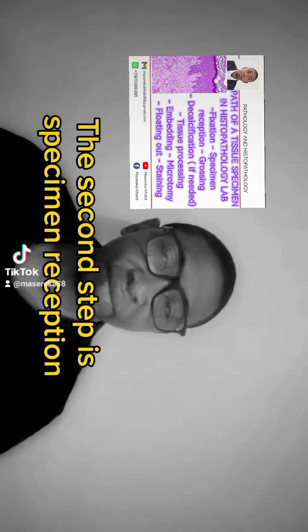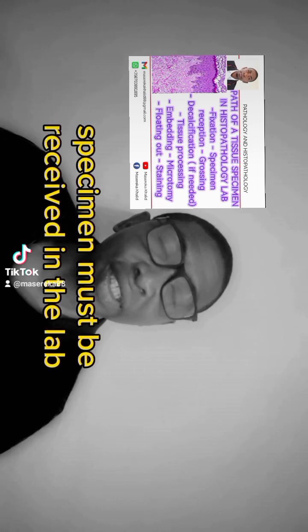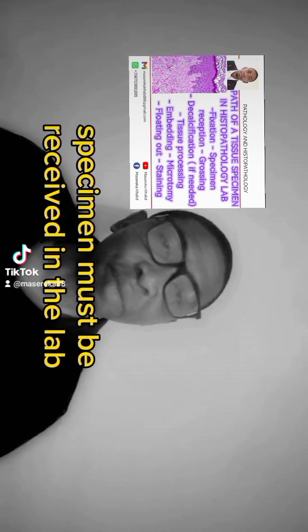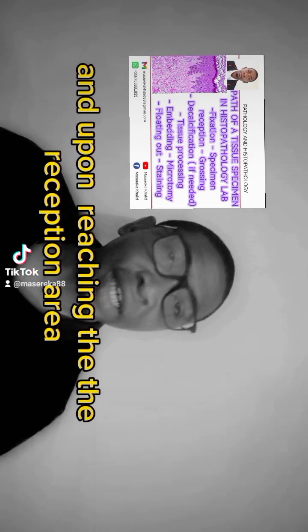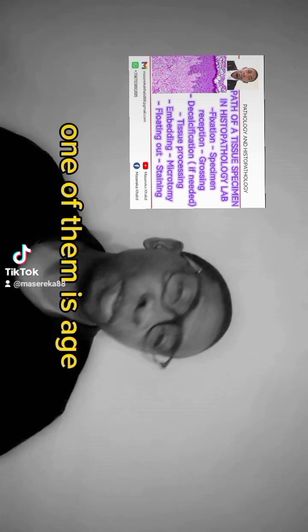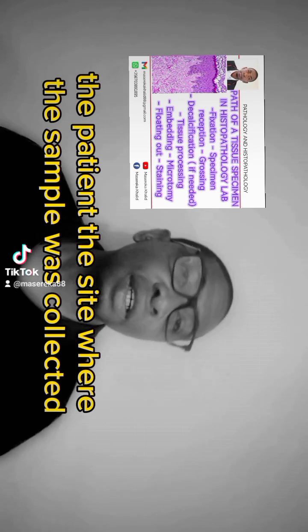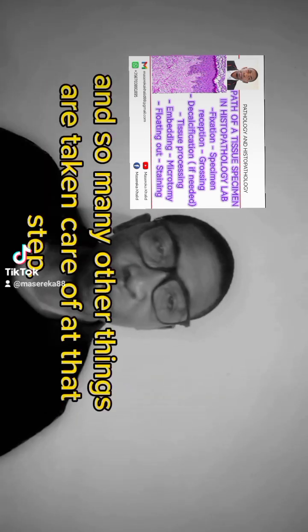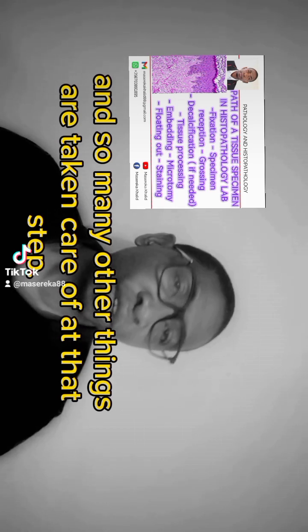The second step is specimen reception. This specimen must be received in the lab, and upon reaching the reception area, different things are noted. One of them is the age of the patient, the site where the sample is collected, and so many other things are taken care of at that step.